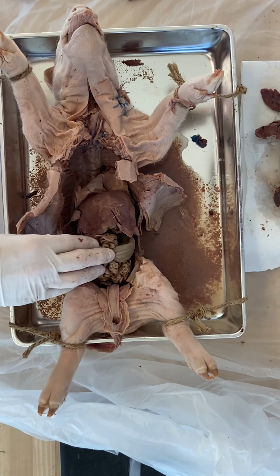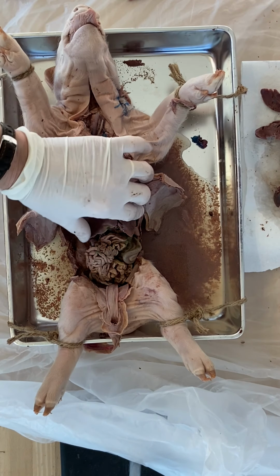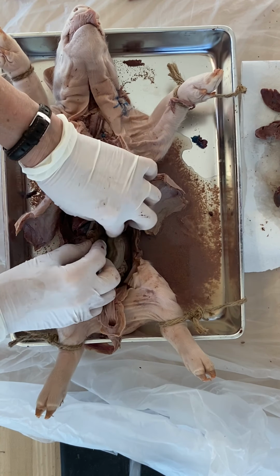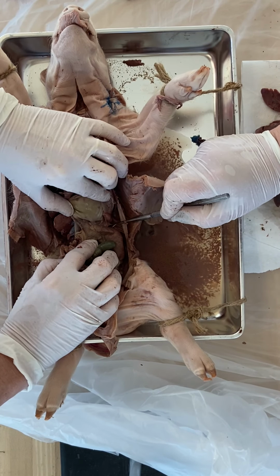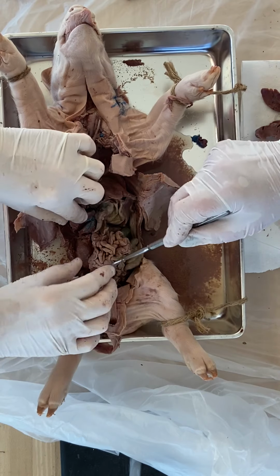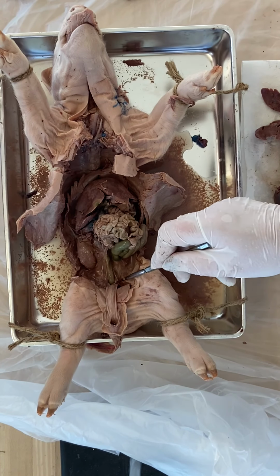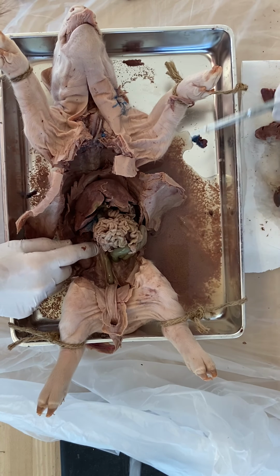All right, well, I think we've done you a good pig. We've seen trachea really clear. We've seen esophagus. We've seen lungs. Huge liver. Heart. Nice gallbladder that we could see. A nice little stomach. Spleen. We saw a nice pancreas. That's one of the nicest ones I've seen. Nice clear pancreas. Nice small intestines, all wrapped up here. Large intestines into the rectum and kidneys at the side. And this is the pig's bladder. Your bladder, of course, is nothing like that shape. Your bladder is more of a round shape, but pig bladder.